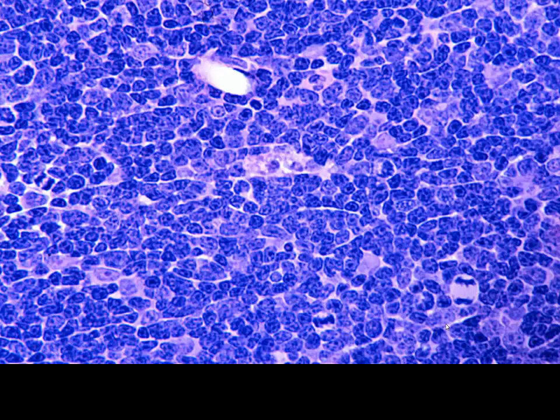Again, just showing a collection of cells that we have here. The darker, smaller cells are going to be our thymocytes, T cells. We may have some B cells, plasma cells present here, but mostly we're talking about the T lymphocytes. And most of these are undergoing their processes of development because we have a number of these that are in different stages of mitosis. You can see these mitotic figures that are present here.